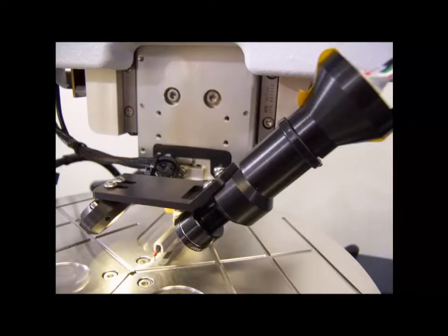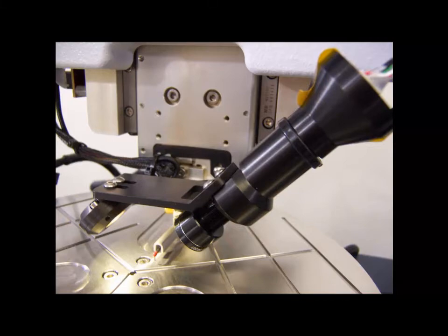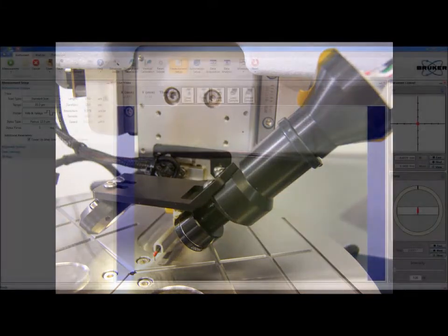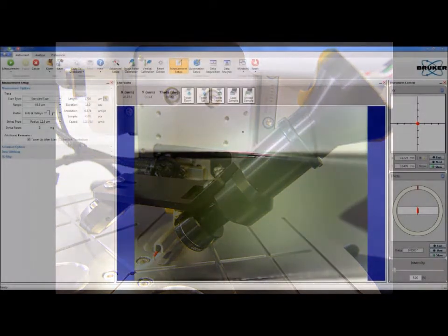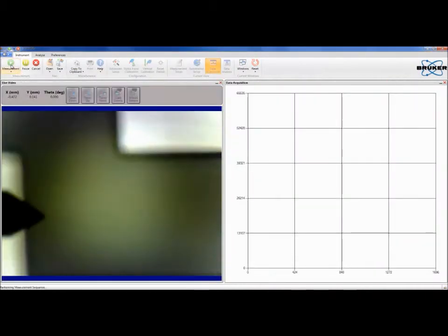The DECTAC XT includes an onboard USB camera and LED illuminator to assist the operator in sample feature location and stylus centering. The live video output of the camera is used to provide scan feedback to the operator during a sample measurement.